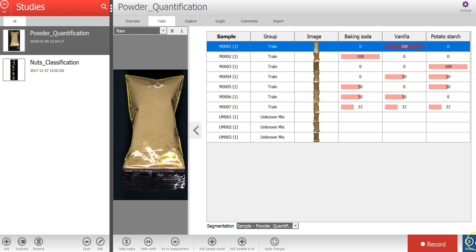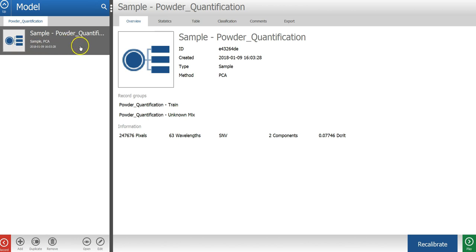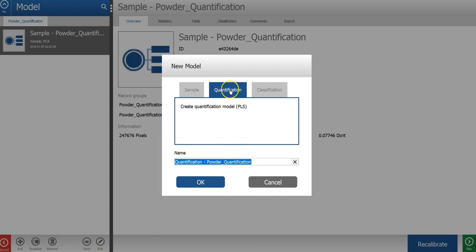So to do that, I will press the model button in the lower right corner of the screen to move to the model mode. Here we can see the sample model that I had created before.